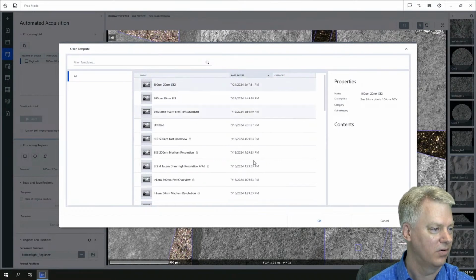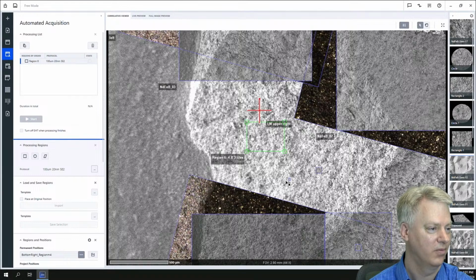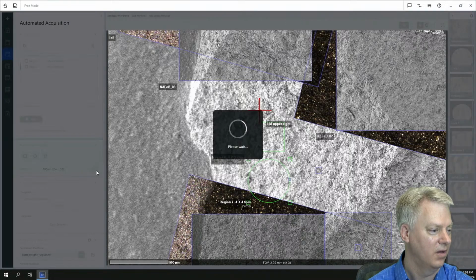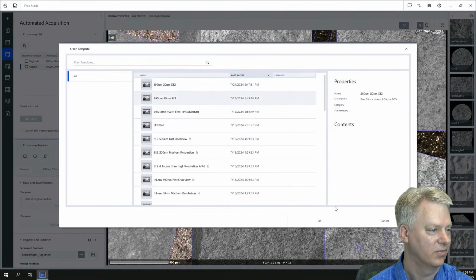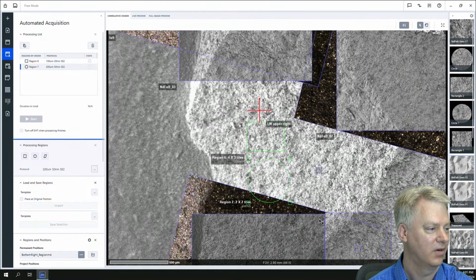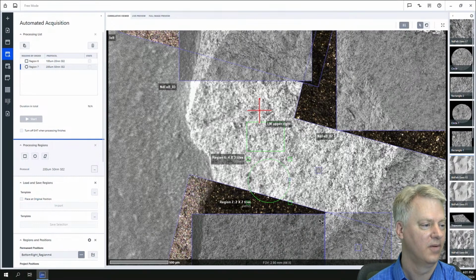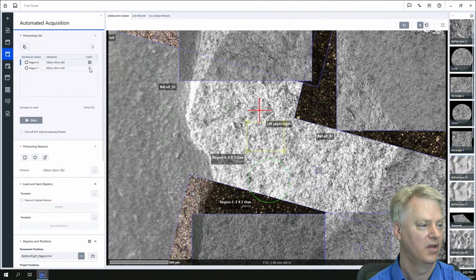I can go in and select the protocol, and like I said, we're just going to stick with what we have there, but that's where you would select it. And let's say that we want to acquire something in a different shape. We'll do a circle. You could also do a trapezoid, but this one we're going to do a circle. We don't want it to be at quite as high of a resolution, so we're going to set that up where this rectangle has more tiles that are higher resolution, and then the circle has the lower resolution. And so you can set up as many of these as you want. You can attach each of them to a different protocol, which gives them different fields of view and resolutions compared to one another. And like I said, you can check each and every one of them, which we'll do going forward. So this is just setting them up, drawing, and now I'm going to select them.